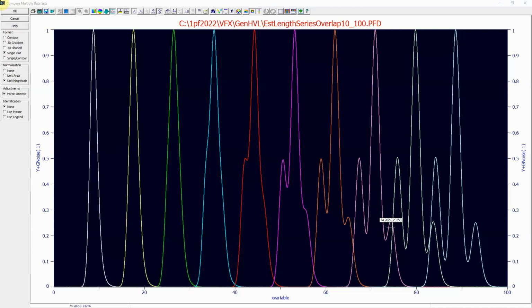In that case, our rule of thumb has been we'd like to see about 1/4 of the amplitude visible as a local maxima component of the overall overlapping feature in order for there to be a high level of accuracy in the modeling.